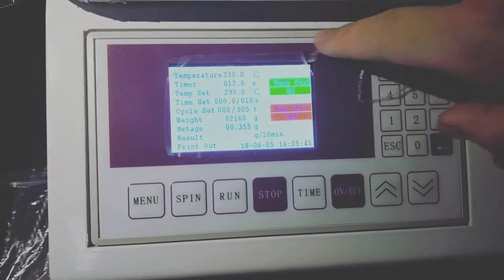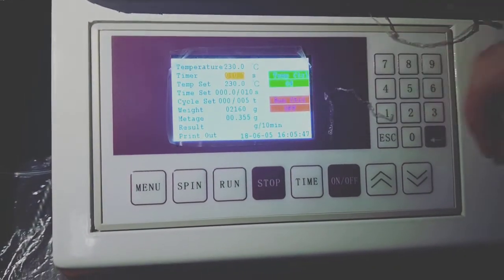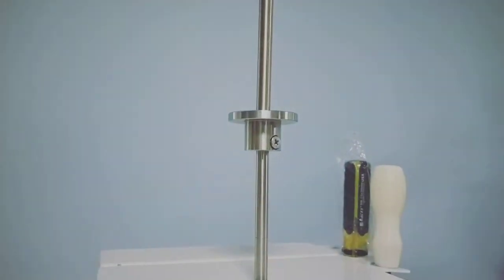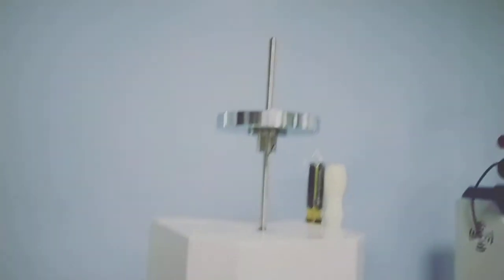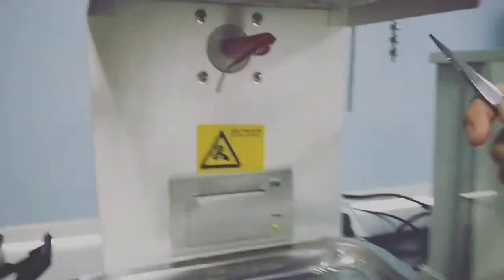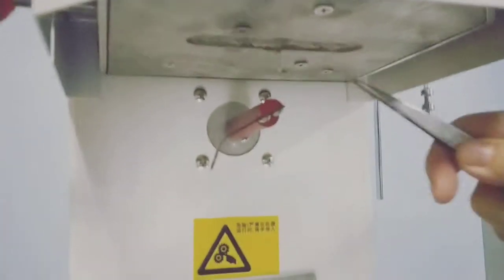Now the time is almost reaching zero. Then we choose this weight, 1835. And this rod is 325. All this added together is 2160. You can see after we add the weight, now there is sample extruded from the die.